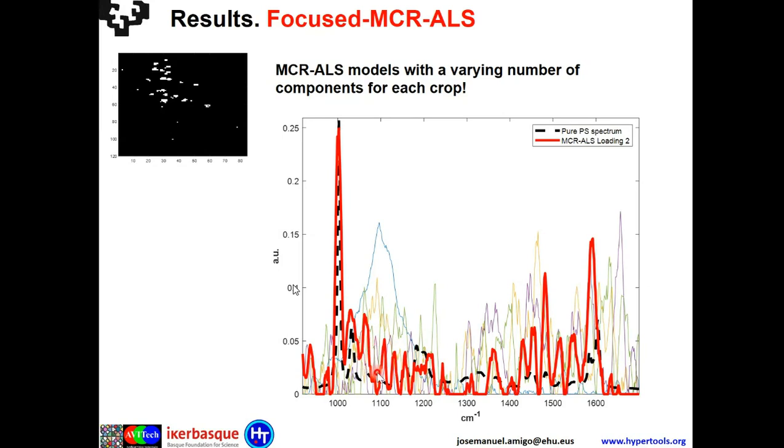find microplastic. So actually, we based our intuition, our validation, on the fact that even though having bad signals for our microplastics, MCR was able to give us this peak, but also this peak. Also here we found some information, and this peak is also important in polystyrene detection. So with this, we have to look at the concentration profiles.